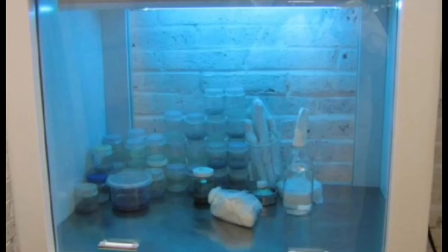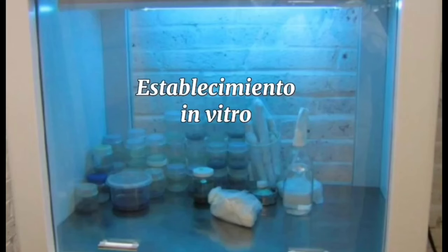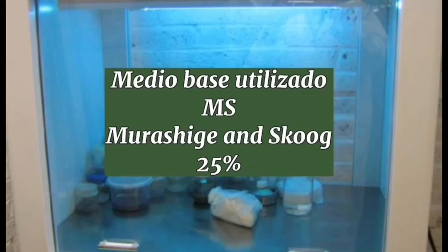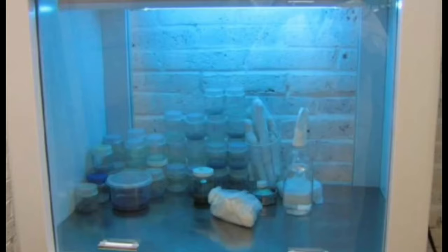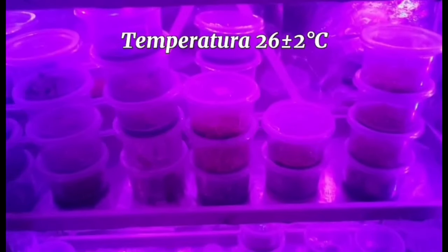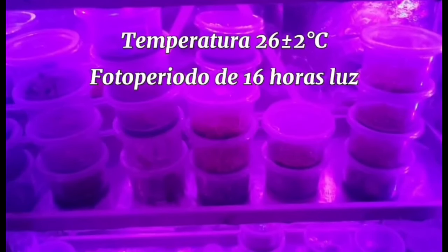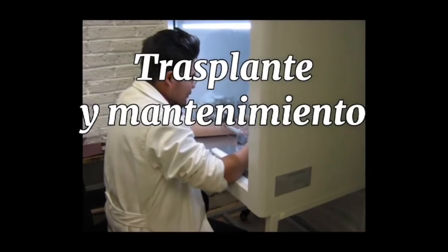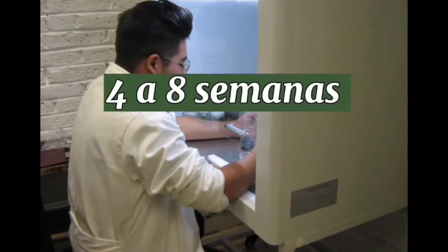La siembra y el trasplante se realizaron en condiciones de asepsia en una campana de flujo laminar. El medio base utilizado fue el MS, Murashige & Skoog, al 25%. Las condiciones de incubación fueron de 26 ± 2 grados centígrados de temperatura, fotoperiodo de 16 horas luz, con una intensidad lumínica de 1,900 a 2,300 luxes provenientes de lámparas LED, a una distancia del material de 30 centímetros. El material se mantuvo con trasplantes periódicos de 4 a 8 semanas según la especie.